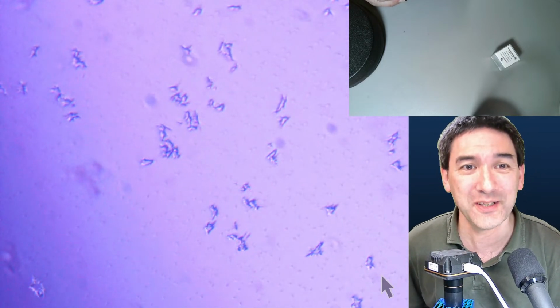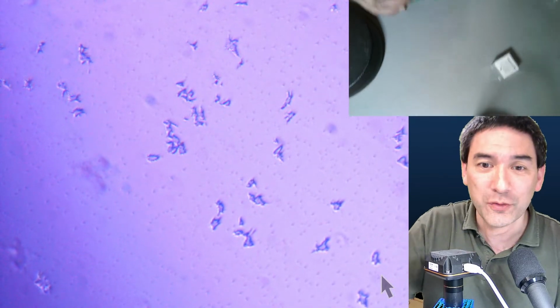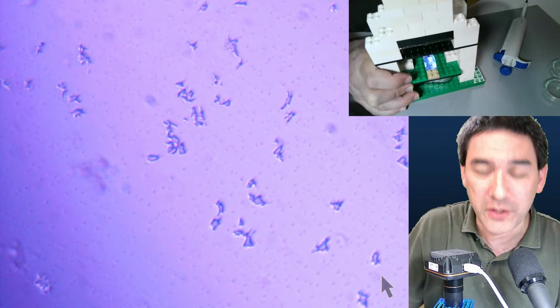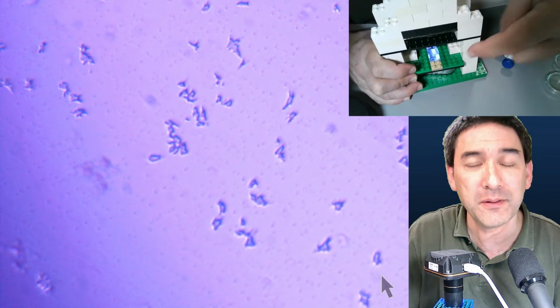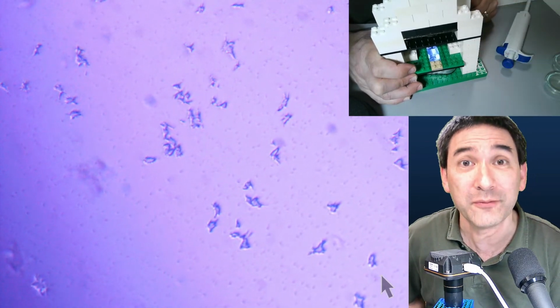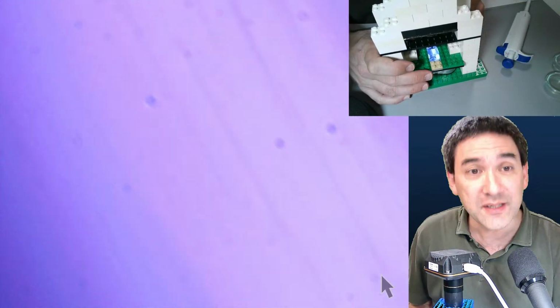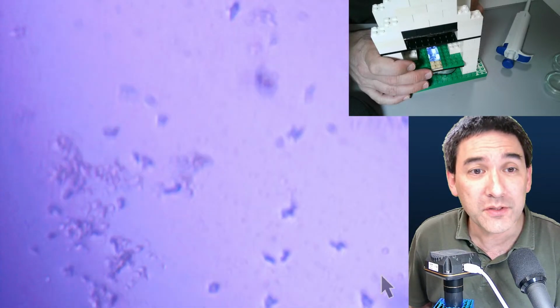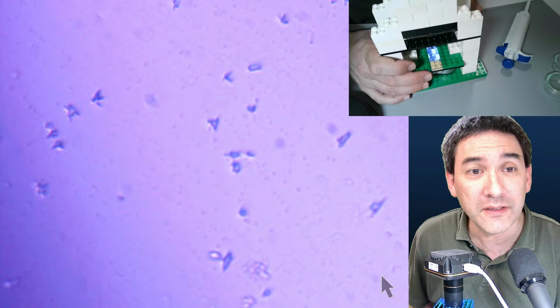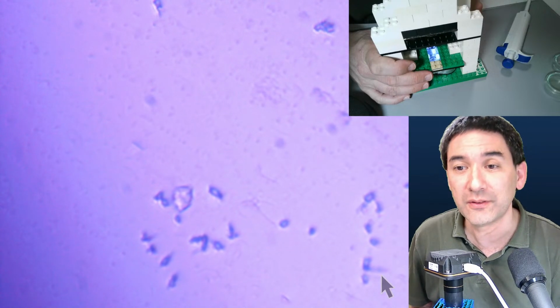Because indeed there is also magnification, of course, written over here on the objective, right? In this case, it's a 10 times objective. But this actually says nothing about the total magnification. The word magnification can mean different things here, okay?